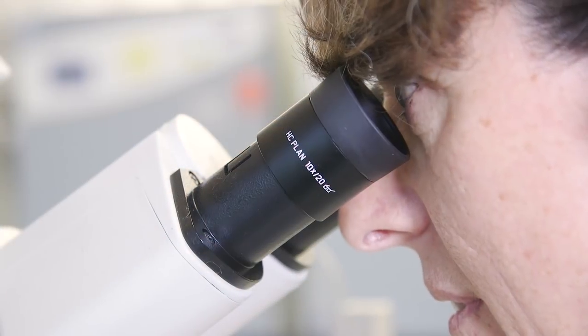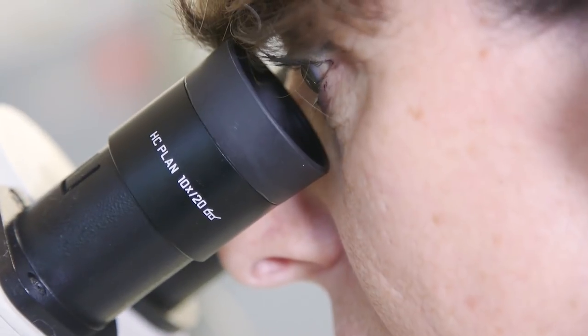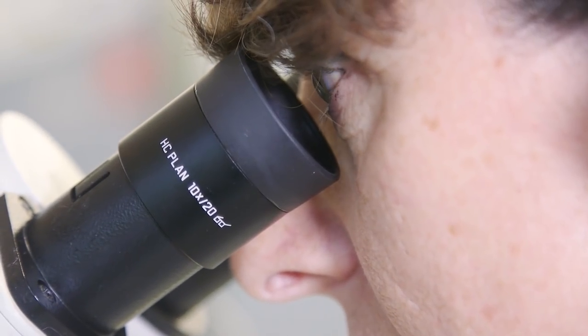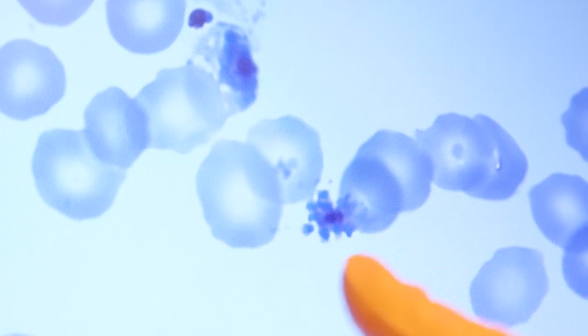This is the mature form of the parasite that will burst out of the red blood cell and invade new cells.